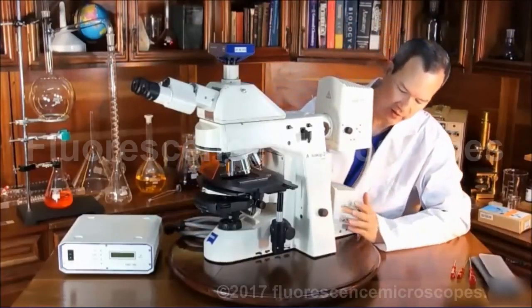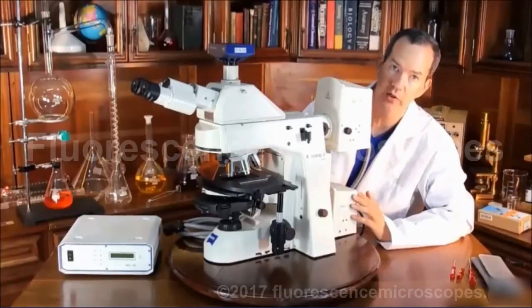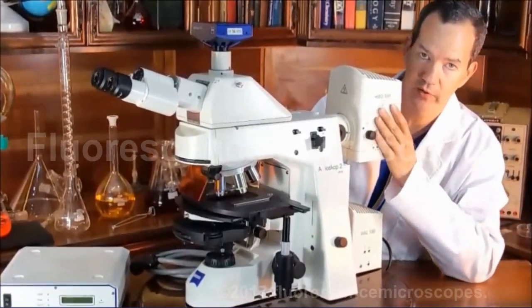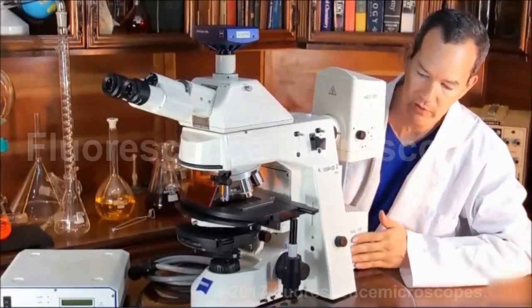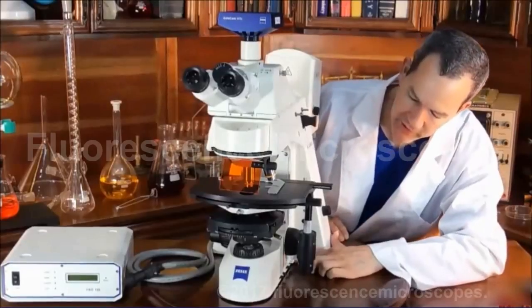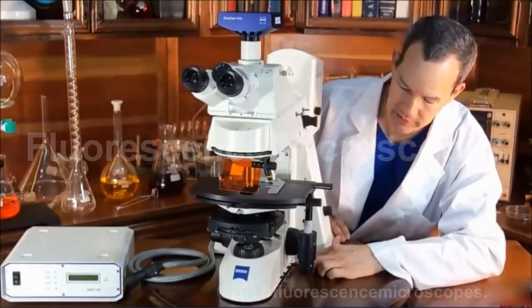And we've configured it with a 100-watt halogen bottom transmitted light. So this is the epifluorescence reflected light, and this is the bottom transmitted. You've also got the frosted diffuser filter. You're normally going to want that in place.